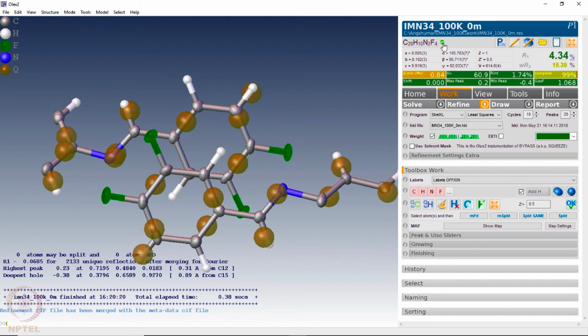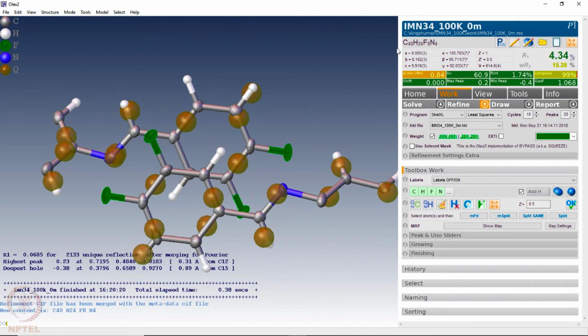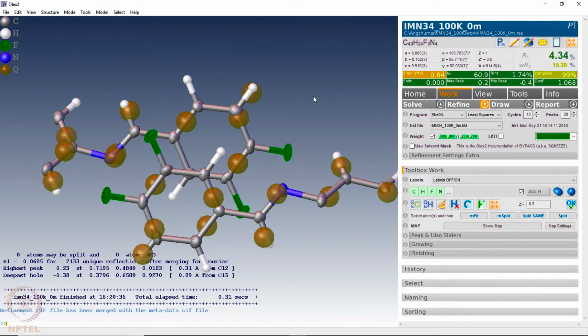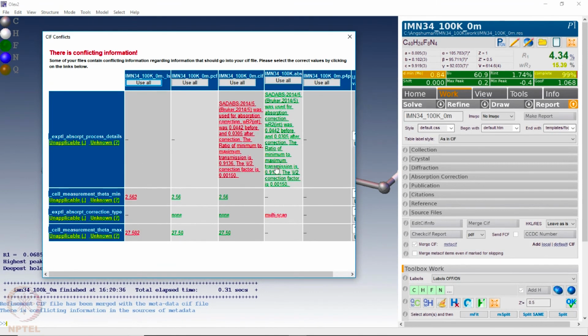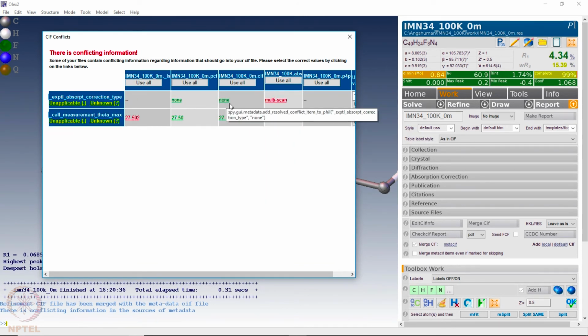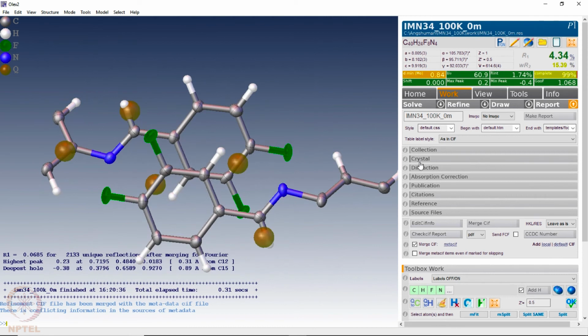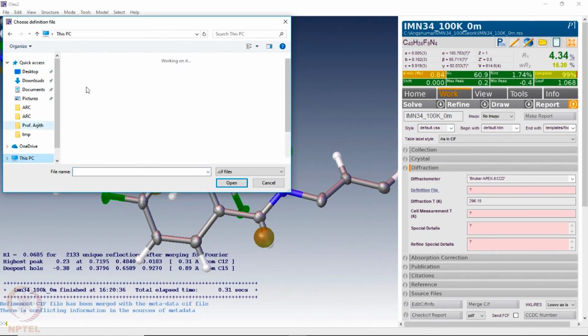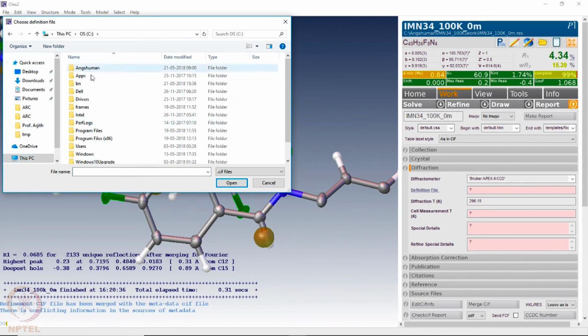So now there is one refresh button here. If we refresh, it then calculates the total molecular formula for this particular system, correct, and then you do a few more cycles of refinement and then you reach the convergence, and from here we go down and do the report generation. We take the ones which are green, and then these are all default parameters which we should incorporate.